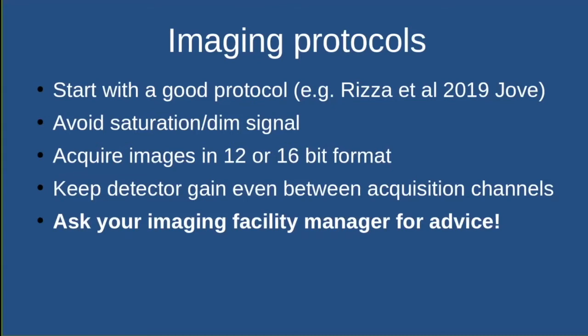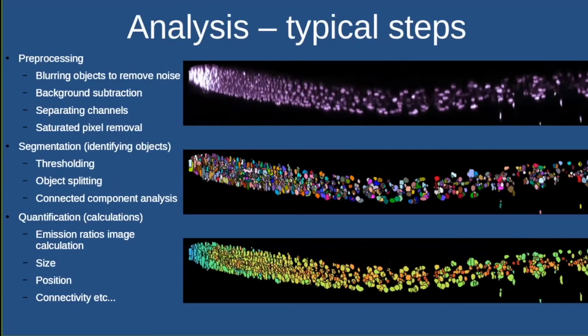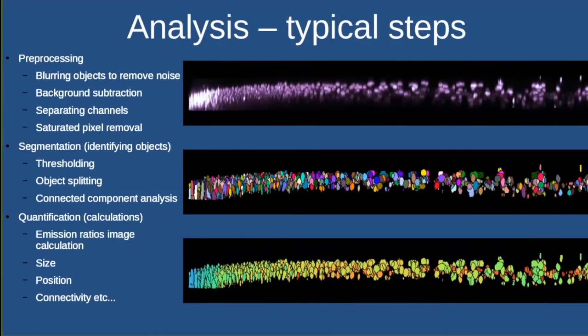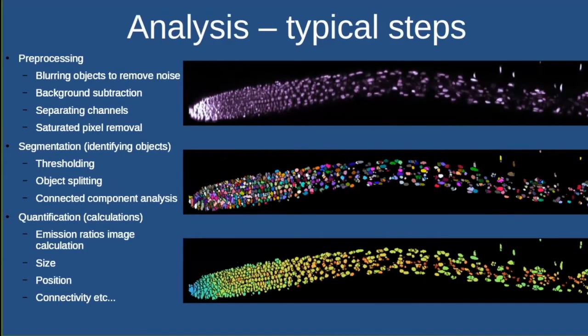Again, once you've got a protocol, it's worth asking your imaging facility manager for a bit of advice, or other people who've done biosensor imaging in your institute. There's a whole wealth of advice out there you can get. Once you've done that, and you've got your first images, you need to start thinking about how you're going to analyze your data, which is often no small task.